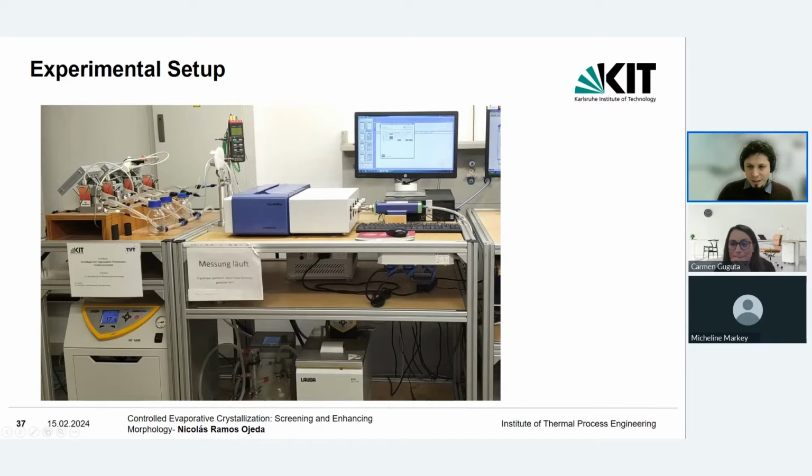So here, maybe you cannot see very well, but there is a nozzle going out from the mass flow controller. It doesn't have a diameter that you can put into a crystalline vial, so you have to use some joint parts, and those joint parts can decrease the diameter for the next hose, and at some point it has the proper diameter to be attached to the lid of a crystalline vial.